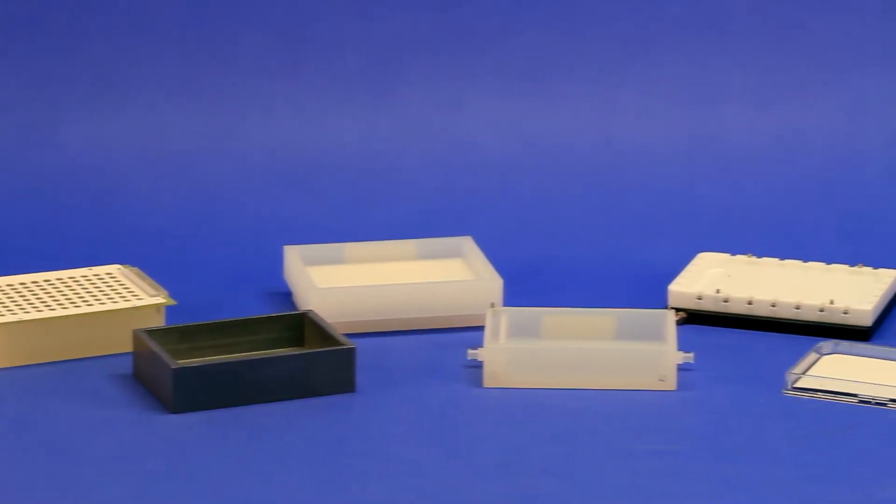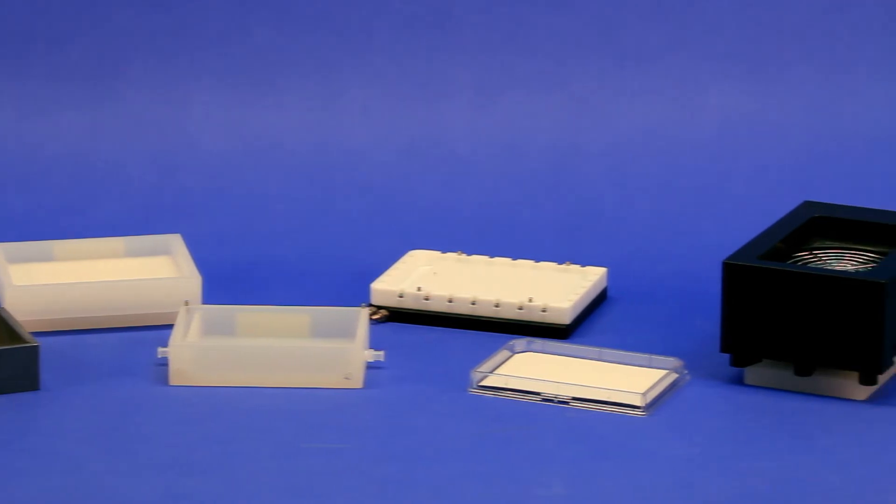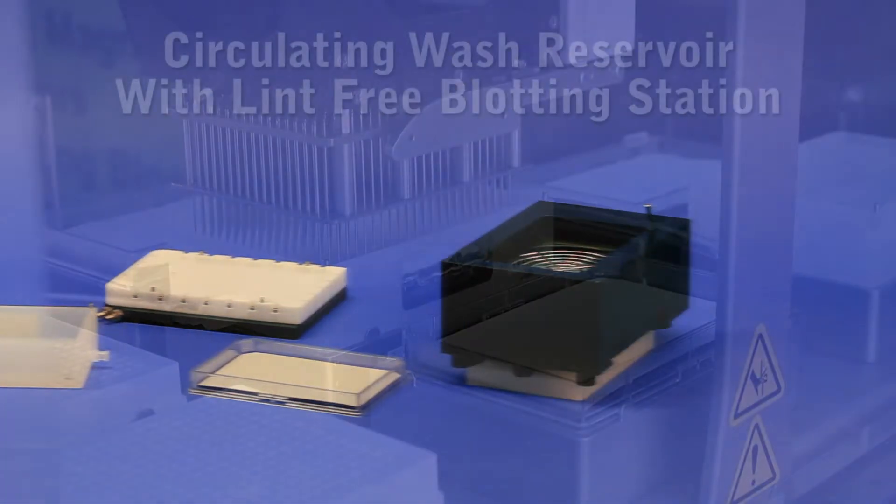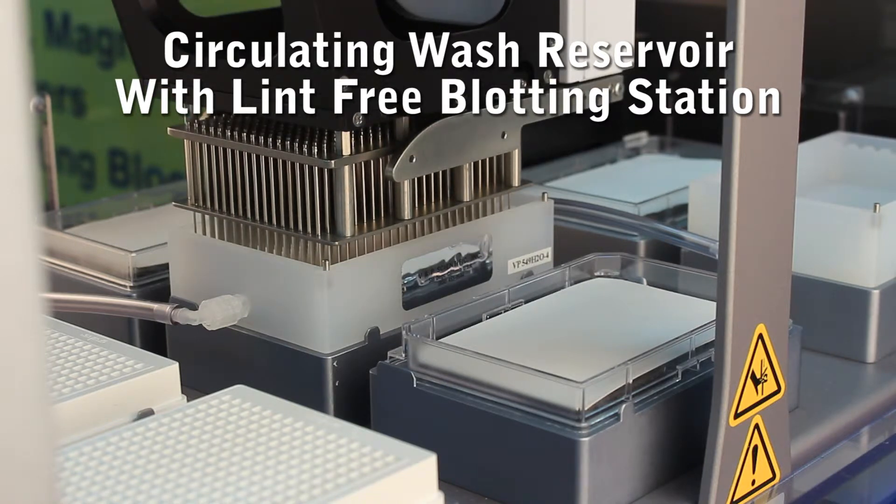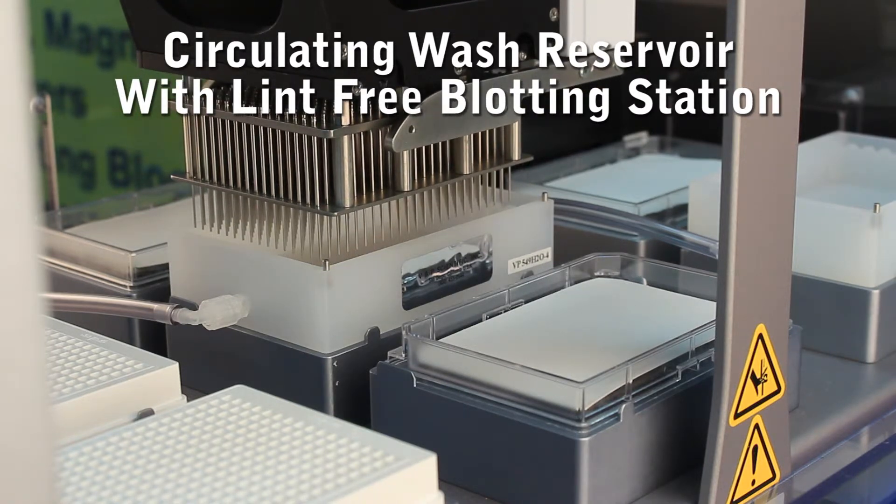VMP makes several washing accessories for your pins to make sure the pins are clean and ready for your next liquid transfer sequence. Our recirculating reservoir helps reduce contamination while washing. You can use bleach, water, DMSO, or alcohol to clean your pins.